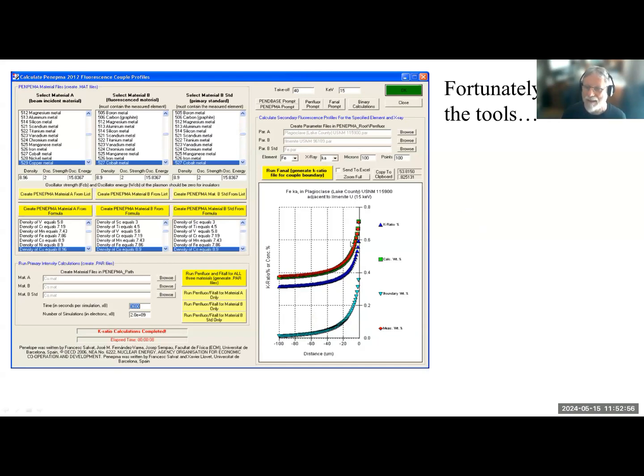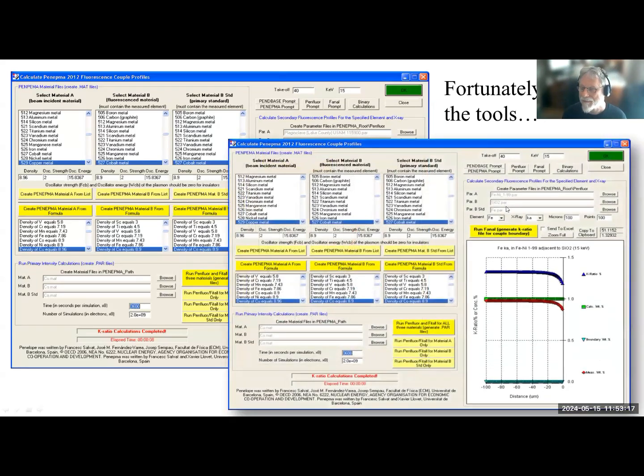We had such a problem with secondary fluorescence from rutile grains in our quartz experiments that we ended up using FIB to remove the experiments, placing them on a TEM grid and then analyzing them in the probe, just so we didn't have that secondary fluorescence. But we can now correct for that, actually.